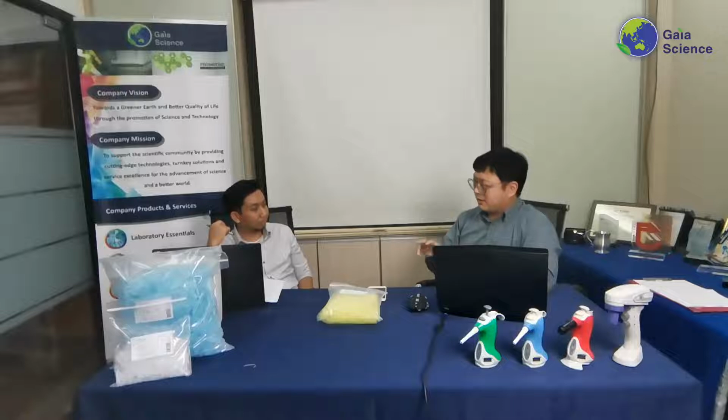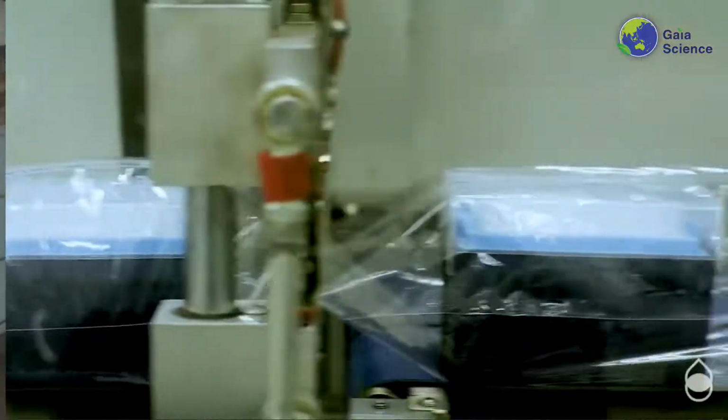When you get any racked tips from outside, whether you buy in cartons or in single ones, they are always individually wrapped. That's the key point here. When it's individually wrapped, the sterility is maintained until you open it. And normally when it's wrapped, you will open it inside the biosafety cabinet, when it's already been sprayed down with alcohol as well.